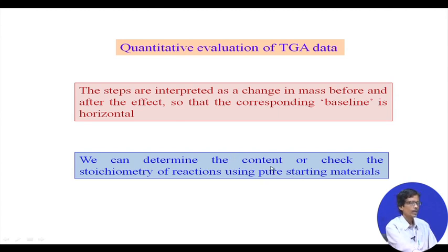But remember that in case of pure calcium or pure magnesium present in the sample, we get quantitatively the corresponding amount of oxalates, but real samples are not so pure.